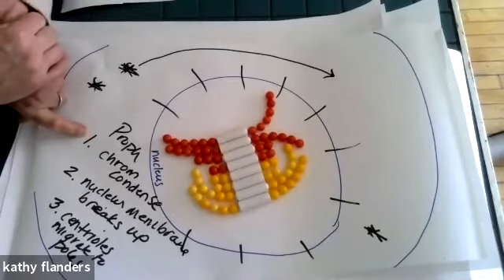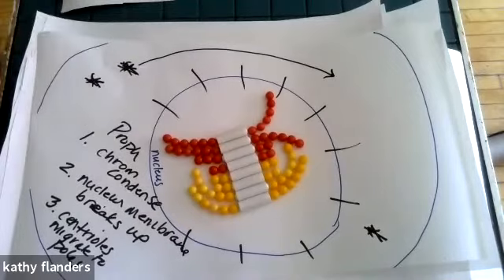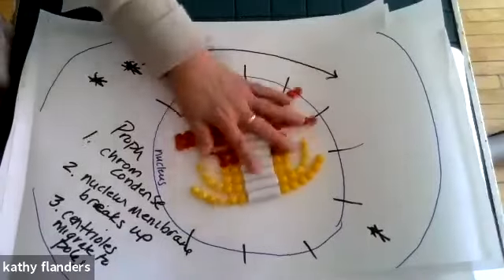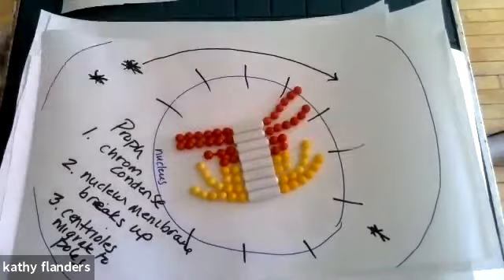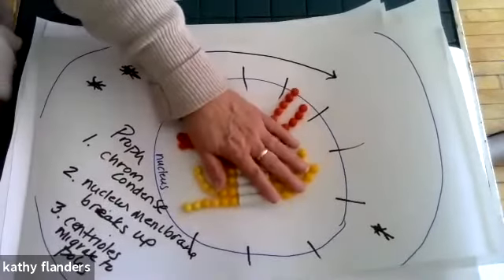What happens in prophase? The chromosomes condense. Chromosomes condense, and there they have condensed. Then the nuclear membrane is disintegrating.